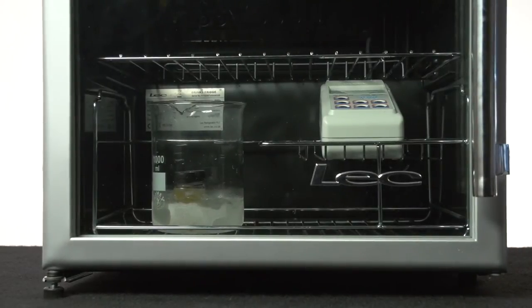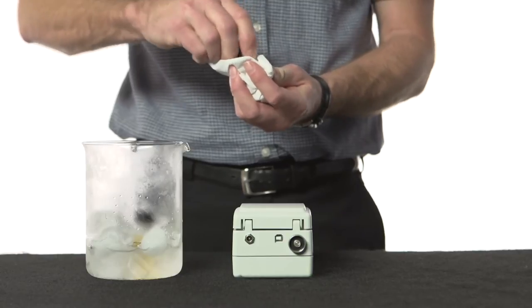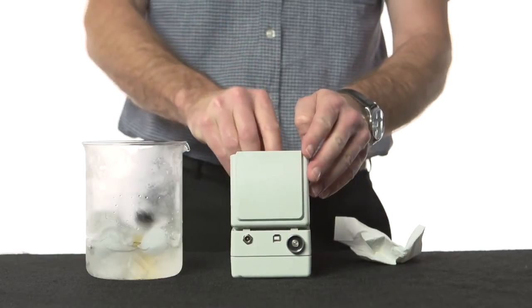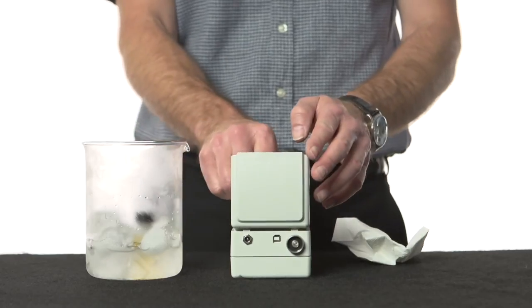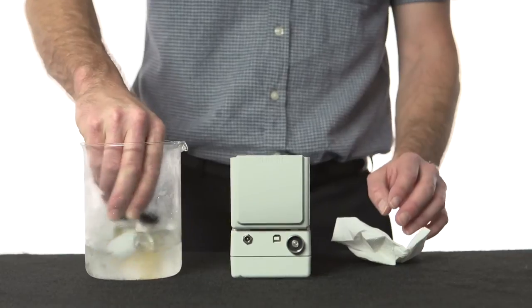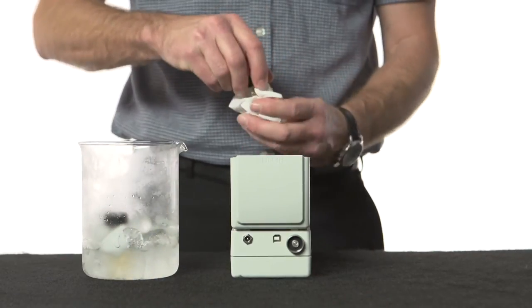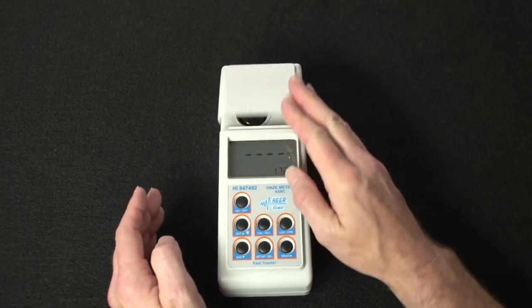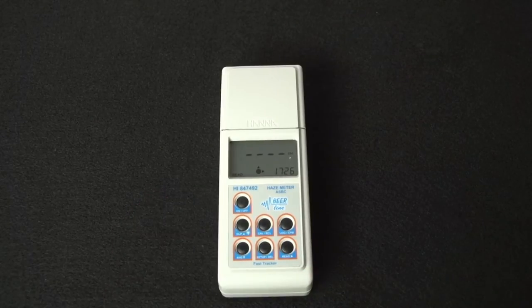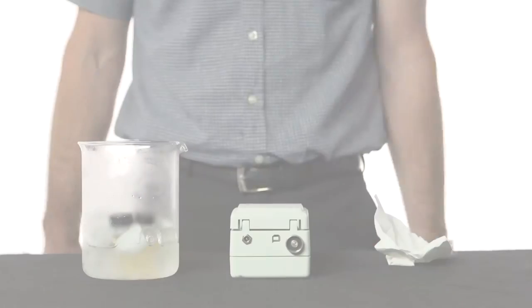After this time has elapsed, the cuvette is removed from the ice bath, wiped thoroughly to remove the moisture, and is immediately inserted into the haze meter where the second reading is then taken. It is important to do this as quickly as possible and take the first reading, as the beer warms up the precipitated proteins will start to re-dissolve back into the beer, giving a lower haze reading and thus not accurately predicting the colloidal stability of the beer. This haze reading is referred to as the total haze.